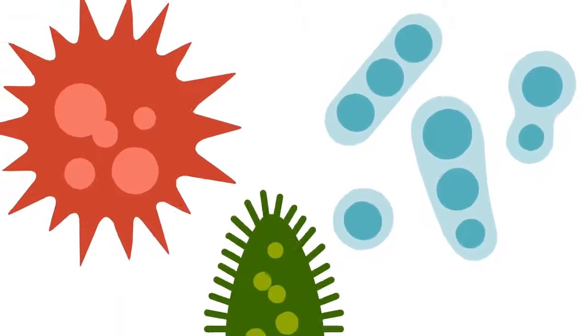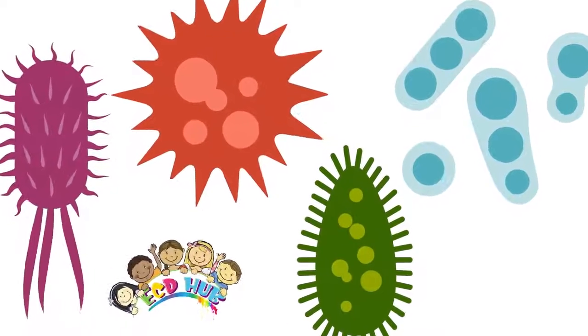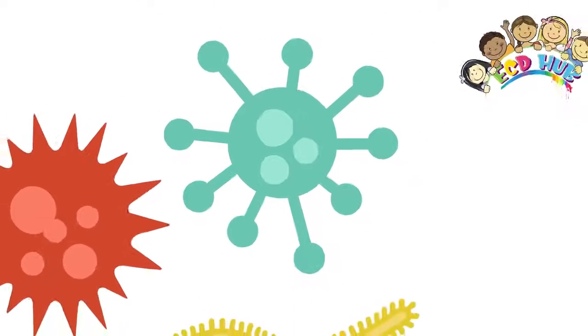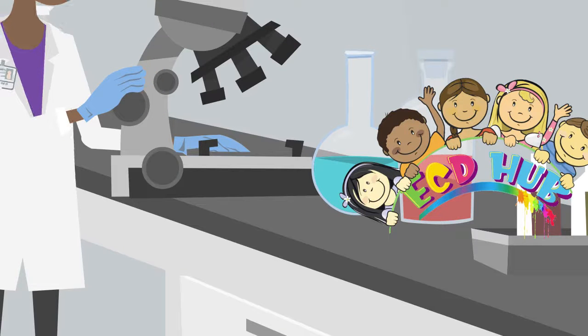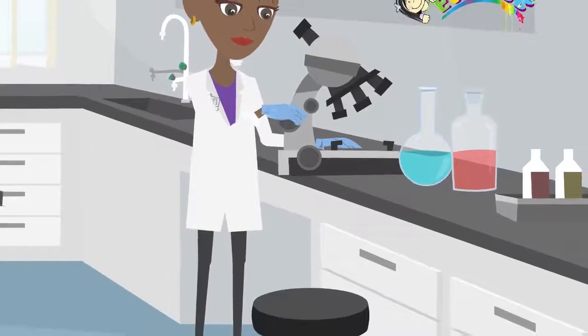Most important, always carry your microscope by the carrying handle. Picking it up by any other part will damage the microscope. Then plug it into an outlet and flip the switch to on. You will know your microscope is on because the light will be shining. The light sits at the bottom of the microscope and directs light up through an image towards your eye.